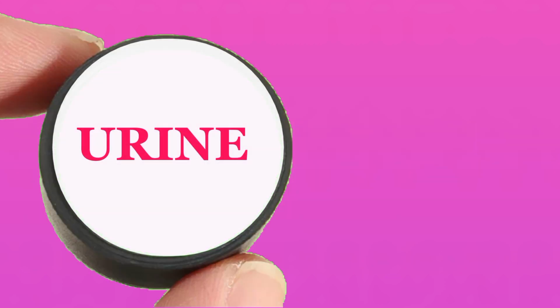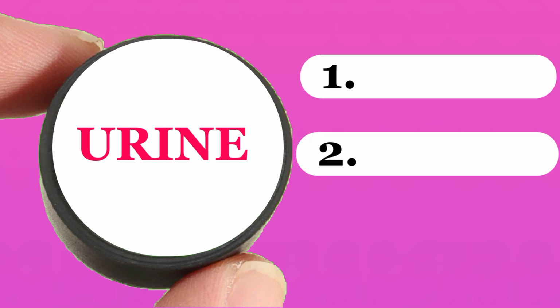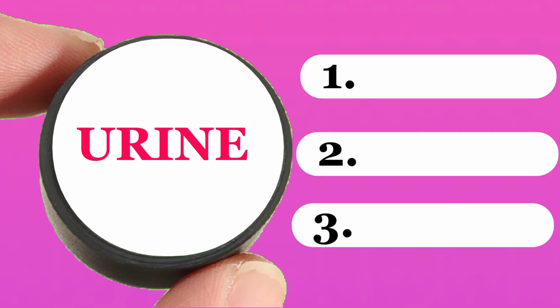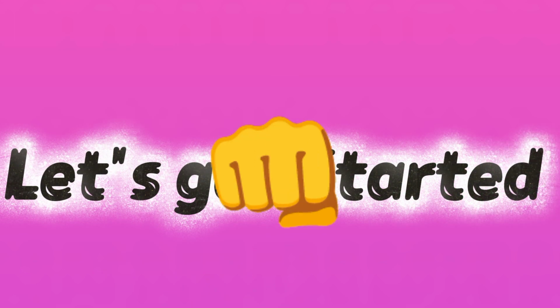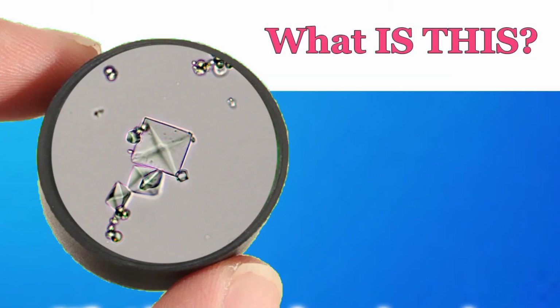In today's video, we will look at urine microscopy and learn how to identify important elements under the microscope such as cells, crystals, and parasites. Let's get started. What is this under urine microscope?